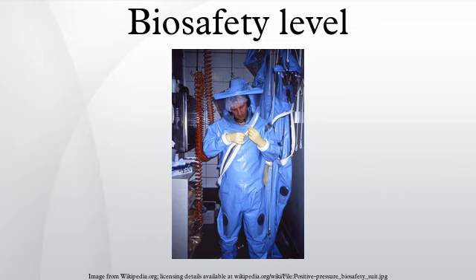Agents with a close or identical antigenic relationship to Biosafety Level 4 agents are handled at this level until sufficient data are obtained either to confirm continued work at this level, or to work with them at a lower level. Members of the laboratory staff have specific and thorough training in handling extremely hazardous infectious agents, and they understand the primary and secondary containment functions of the standard and special practices, the containment equipment, and the laboratory design characteristics. They are supervised by qualified scientists who are trained and experienced in working with these agents. Access to the laboratory is strictly controlled by the laboratory director.